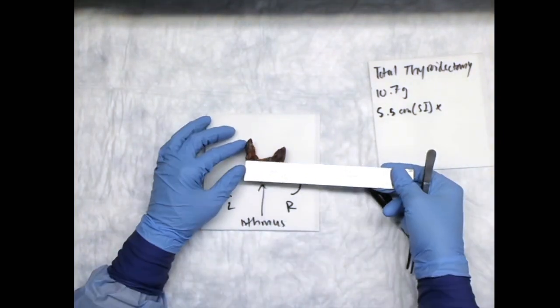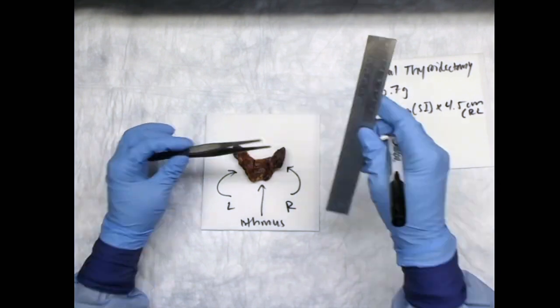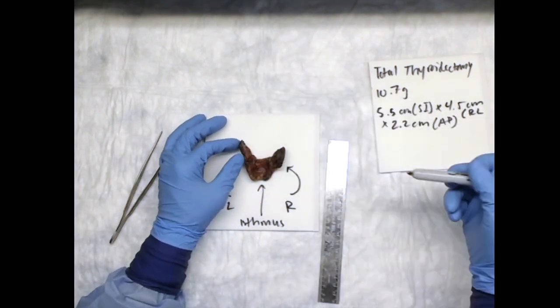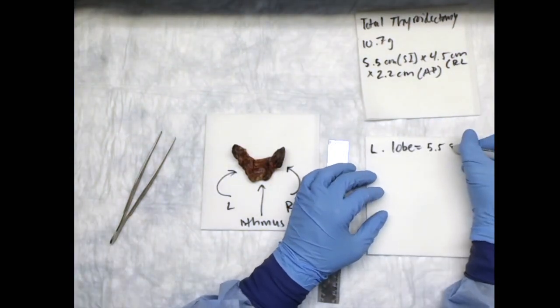For hemithyroidectomies, the flat and slightly concave aspect of the thyroid lobe is posterior, and a small nub of the isthmus will usually be present on the inferior medial aspect of the lobe. On occasion, the surgeon may have placed sutures for orientation on the specimen.